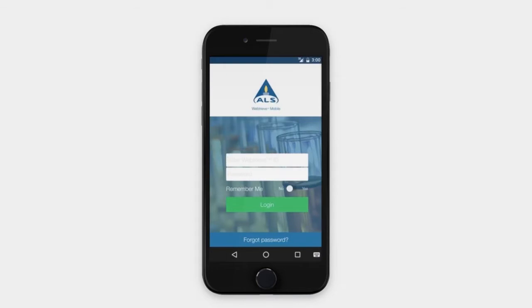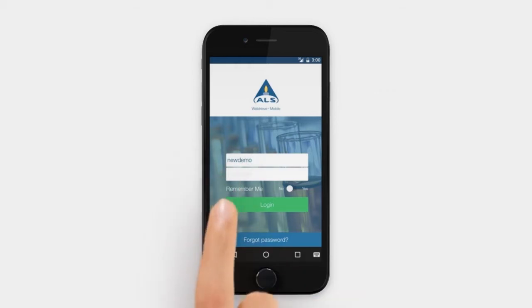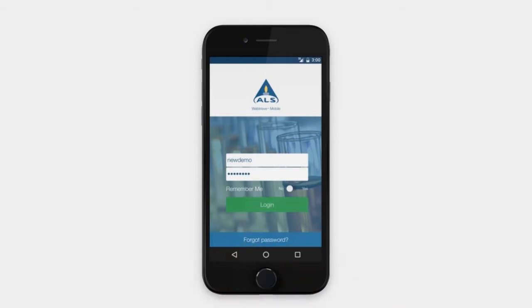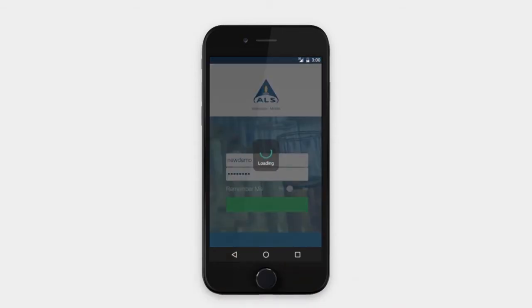Log into the app using the same username and password from the desktop version of WebTreeve. If you do not have a username and password, you can contact your local laboratory or go to the WebTreeve site to request one.